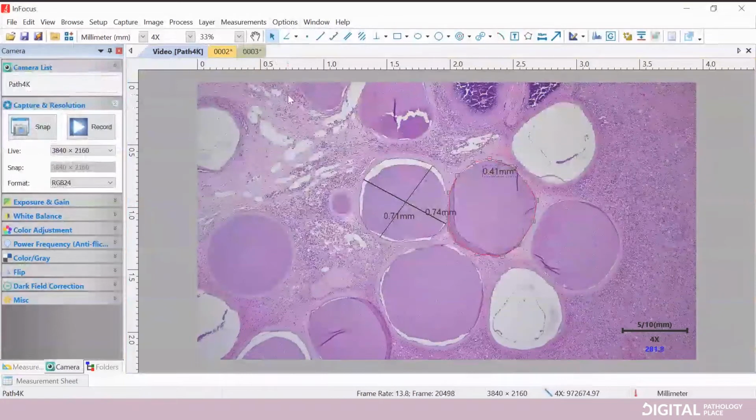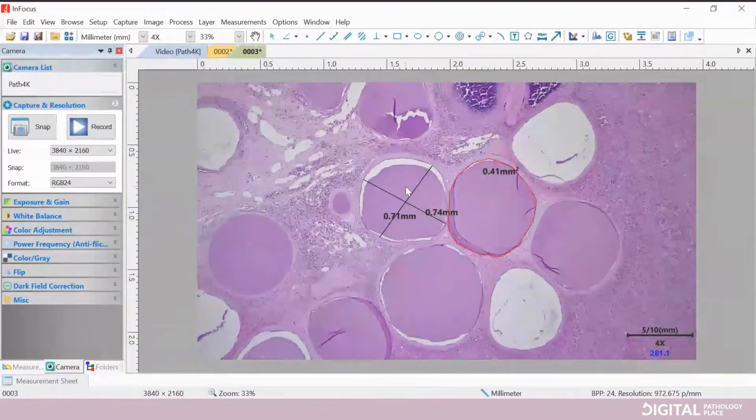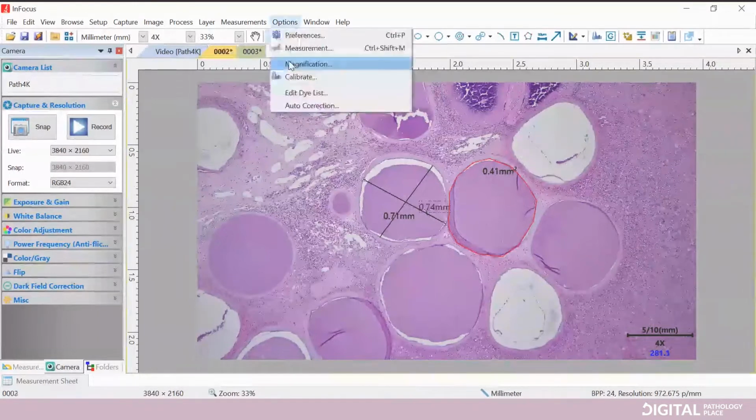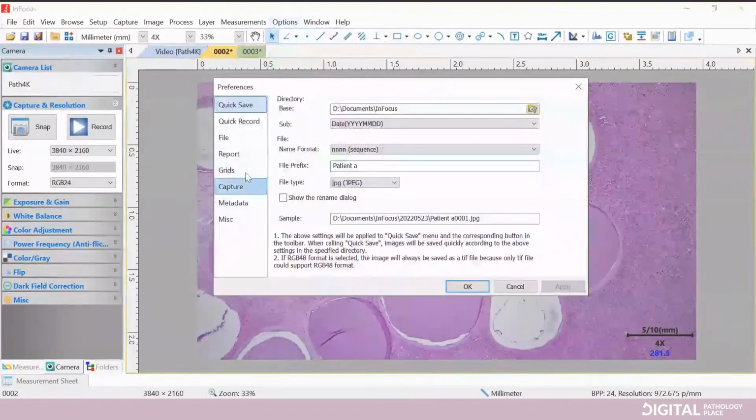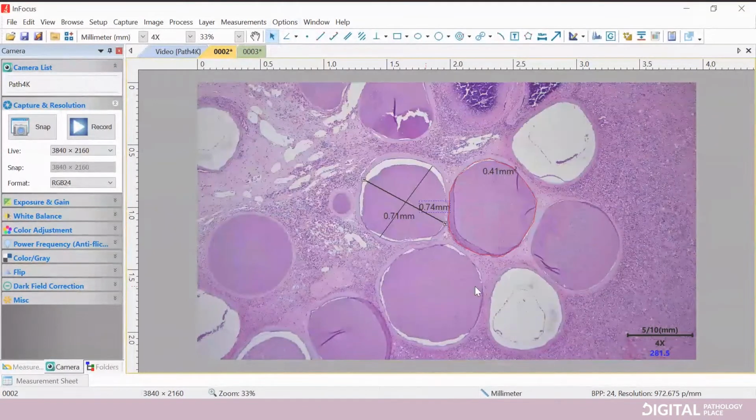We then have our image 3 here, but these are now burned in. So now I don't have the ability to have my raw unedited image. So again, that's why I leave this for most people to capture with measurements but not merge, because then in this case, we have our image.